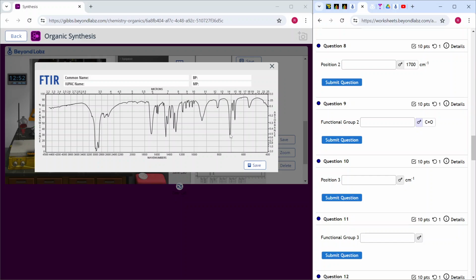This peak at 700 is the carbon double bond carbon of the benzene. It tells you that it's a monosubstituted benzene, but it's so far away in there. See how many peaks that is? So this is why they only care about the carbonyl, and also they care about the sp2 CO stretch.